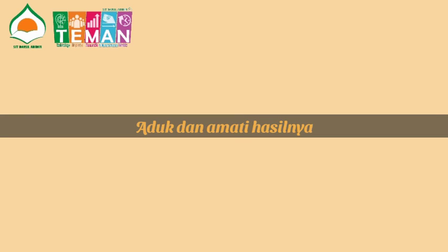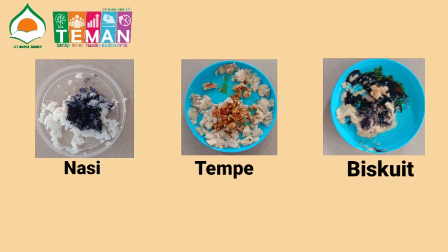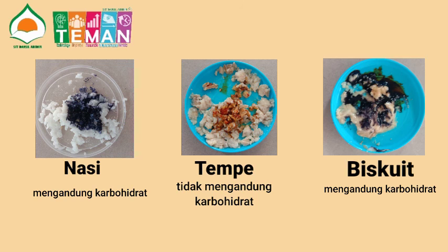Setelah semua sudah ditetesi, kita aduk dan amati hasilnya. Pada nasi, hasil yang dapat dilihat adalah nasi menampakkan warna biru kehitaman. Sedangkan tempe tetap menampakkan warna asli betadine yaitu orange kekuningan ataupun kemerahan. Untuk biskuit, biskuit juga menampakkan hasil berwarna biru kehitaman. Jadi kesimpulannya adalah nasi mengandung karbohidrat, tempe tidak mengandung karbohidrat, dan biskuit mengandung karbohidrat.